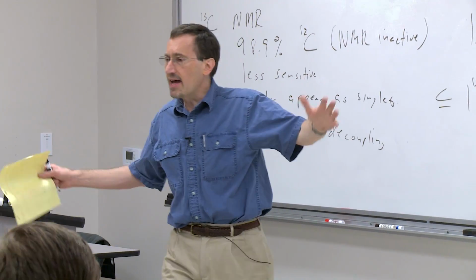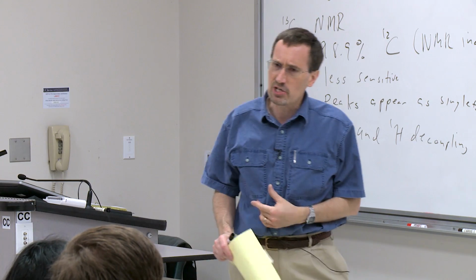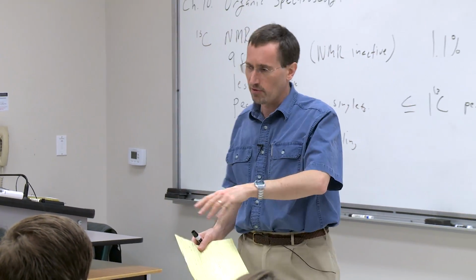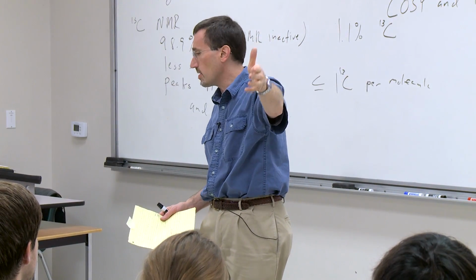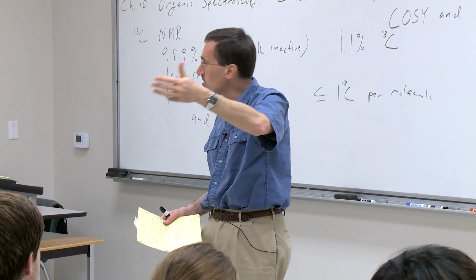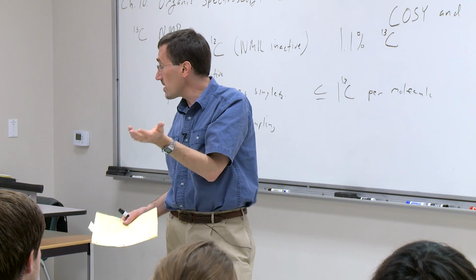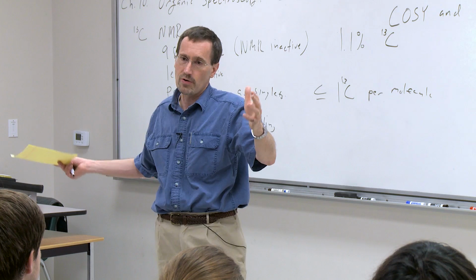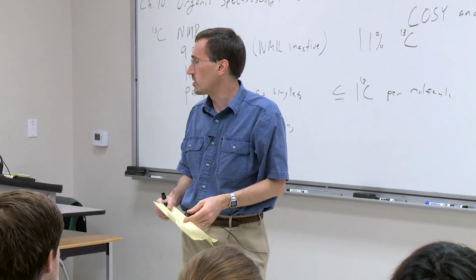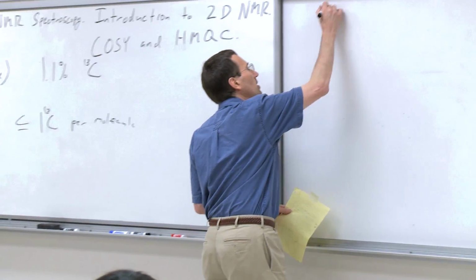Carbon-13 NMR has a tremendous spread of chemical shifts. Whenever I sketch out a proton NMR spectrum, I'll sort of sketch from 0 to 10, even though you can have peaks that are negative and you can have peaks beyond 10. When I sketch out a carbon-13 NMR, I'll probably sketch from 0 to 200, about 20 times as big, because there's about 20 times as much dispersion.